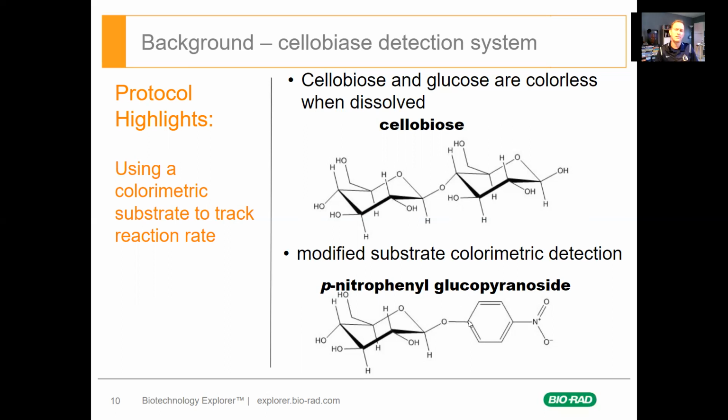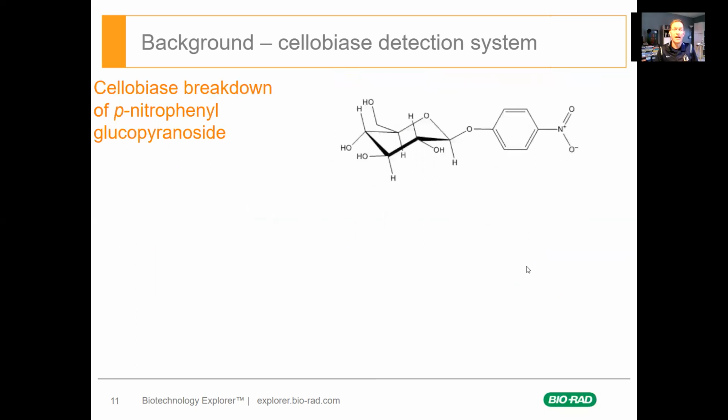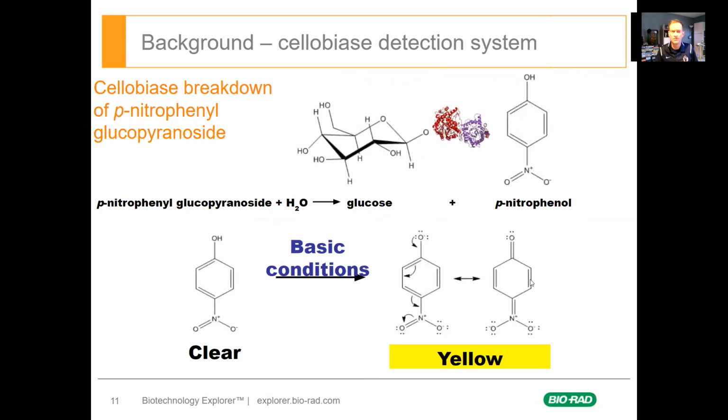We have this alcohol, nitrate, and benzene. What ends up happening is it emits a bit of color, okay? When I put this stuff into water, I don't really see much of anything. However, when Cellobiase works on it, splits that 1,4 bond, it gives off the para-nitrophenol that was on it. It's still colorless, I can't tell.